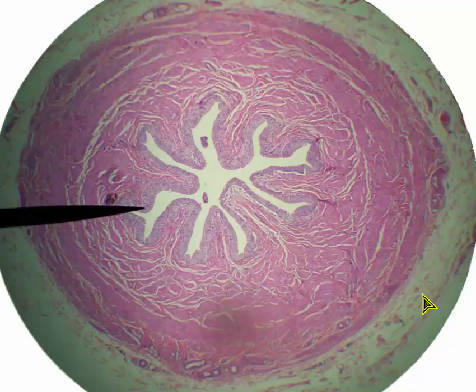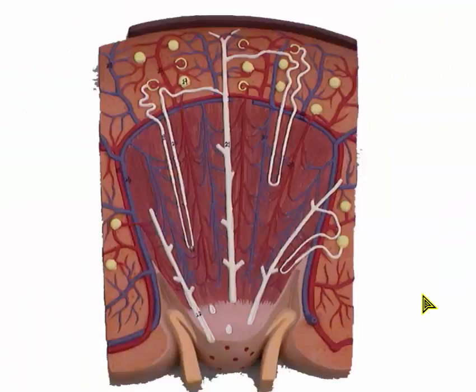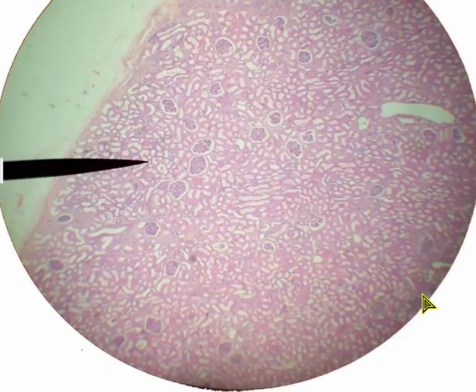And that's it for urinary histology. Let's do a quiz. Here are the questions that I might ask in a lab exam if this is what you saw under the microscope. Name the organ that this section comes from — and if you can't come up with it right away, pause the video and see if you can remember. The organ that this section comes from is, of course, kidney.